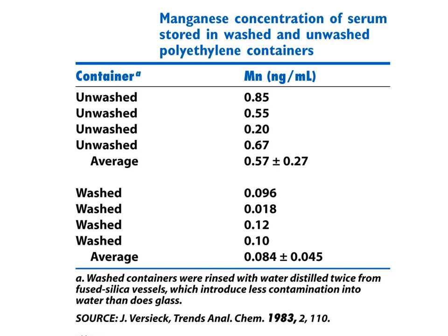Some possible problems, say problems with relatively dirty containers. Now, when dirty, it means it was not washed specifically before usage with some special cleaning agent.